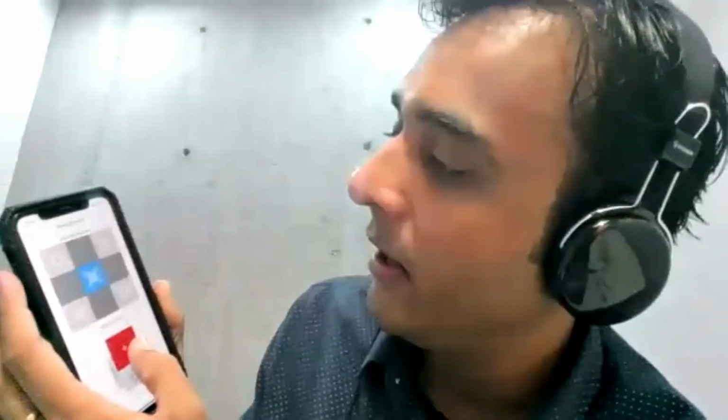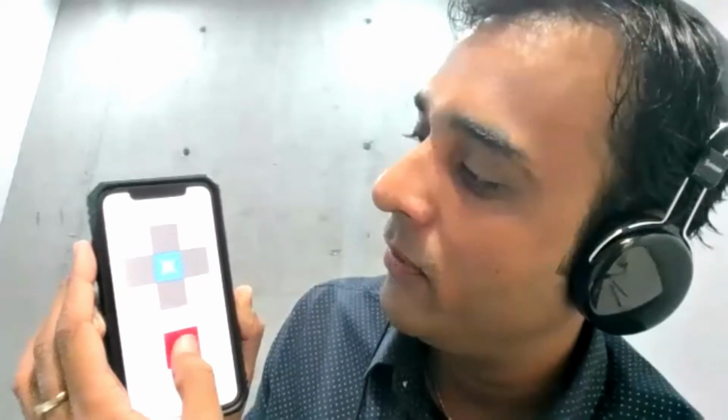Yes, teacher. Okay, if I want to add one more block, I just need to add it. I want to make the 5th square. 1, 2, 3, 4, 5, 6, 7 cells. I find out, calculate again, and it will give you the next number. So you have both options. I just want you to learn the manual one, which is very important also. And this one is very practical. So you have both options. You can quickly count your cells.